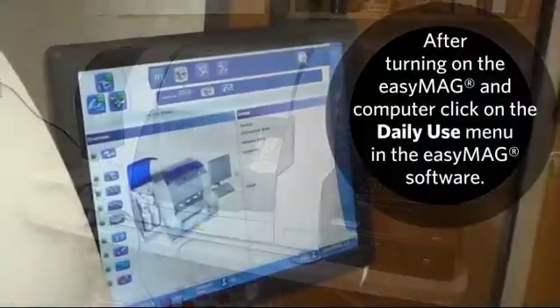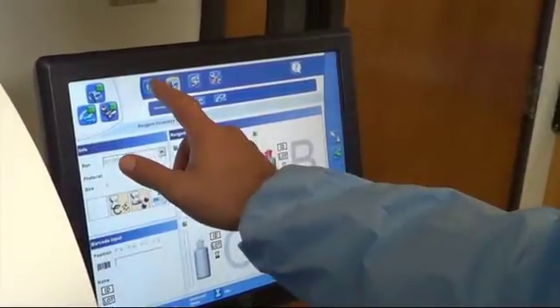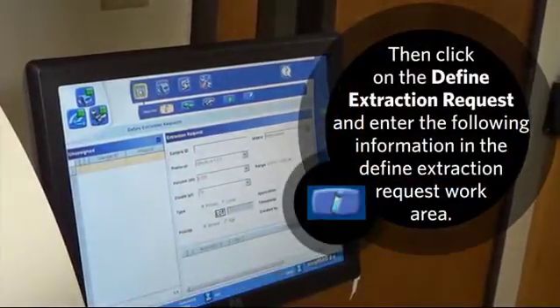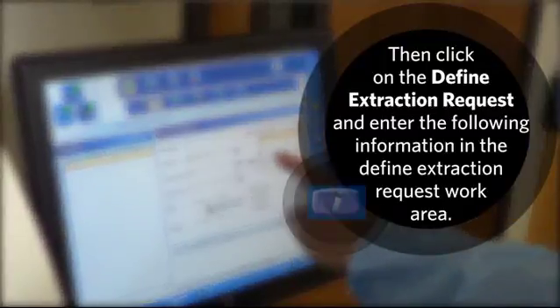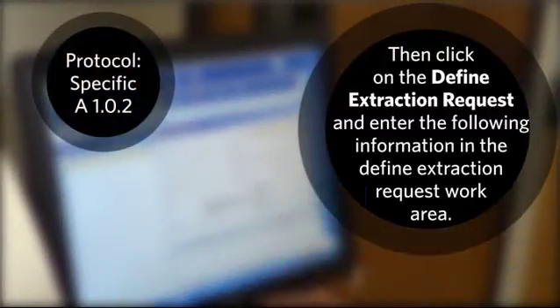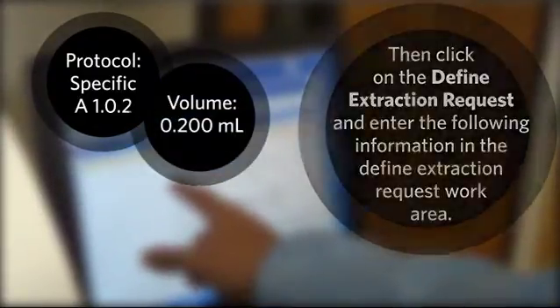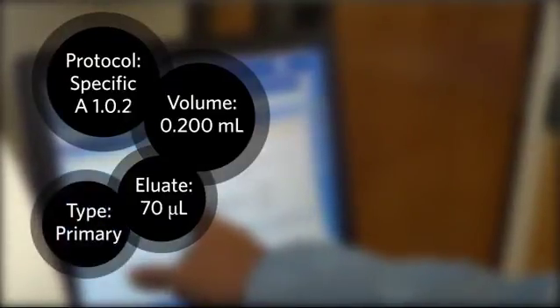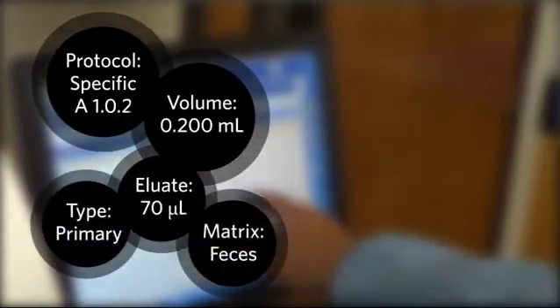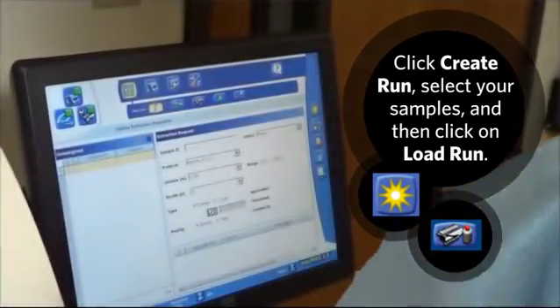After turning on the EasyMag and computer, click on the Daily Use menu in the EasyMag software. Then click on Define Extraction Request and enter the following information: Protocol Specific A 1.0.2, Volume 0.200 milliliters, Elute 70 microliters, Type primary, Matrix feces, and Sample ID for the ID of your sample. Click Create Run, select your samples, and then click Load Run.